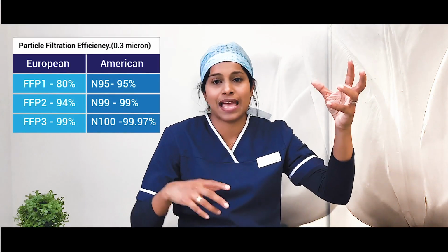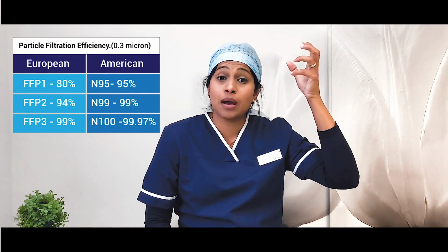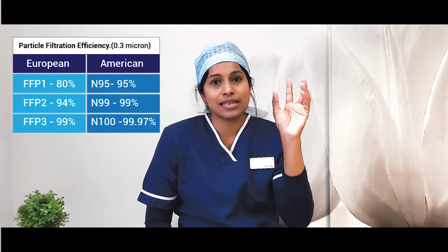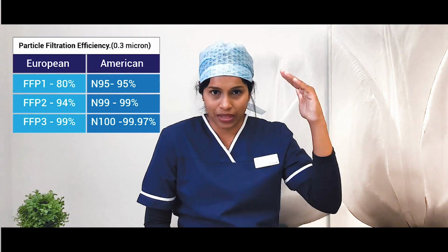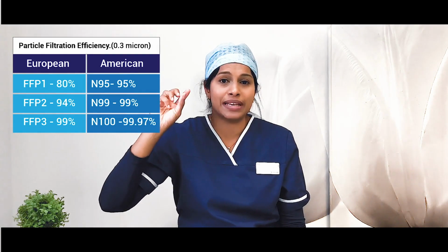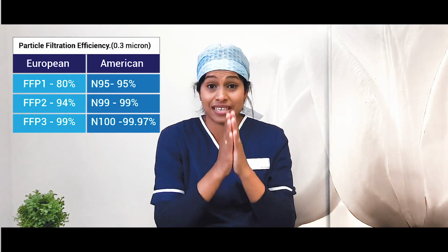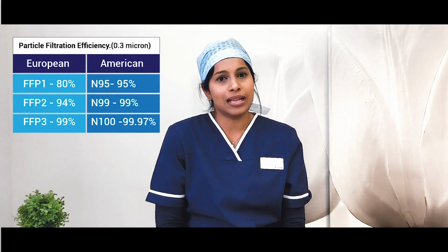There's a European standard and an American standard. The European standard is the FFP, filtering face piece, and that is what is considered as the different types. I'll come to that in a second. In America, it's just by the 95, 99 and 100%, which is the particle filtration efficiency, and that's how the respirators are classified. Like I explained, the bacterial filtration efficiency is not considered very well, because these respirators were not really initially made for the healthcare industry.